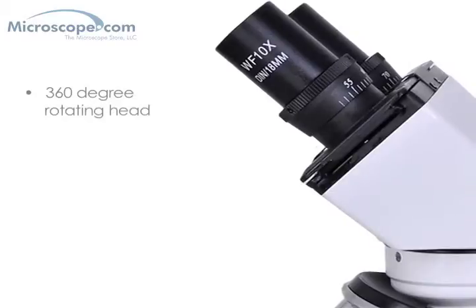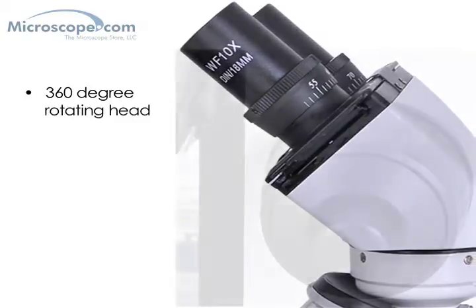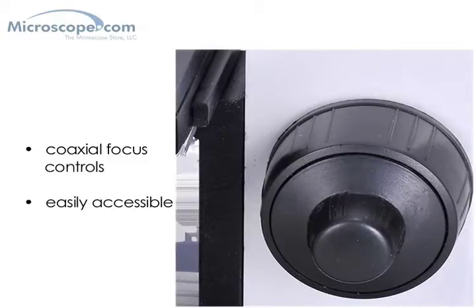The microscope heads on each of these systems are rotatable 360 degrees, which makes sharing the microscope easy. And unlike many microscopes at this price level, the system has coaxial coarse and fine focus controls, so you don't have to grope for the controls when looking through the eyepieces. The adjustments are there at your fingertips without the need to look for them.